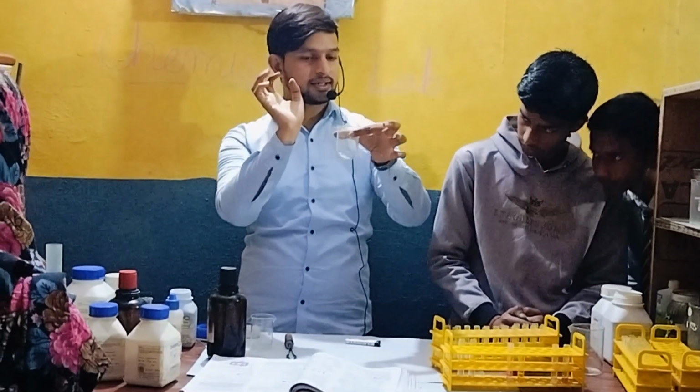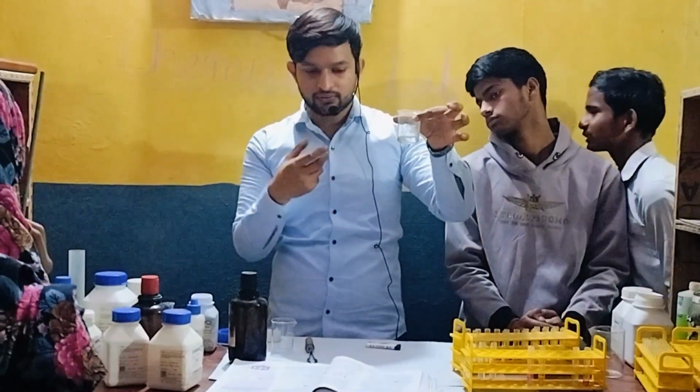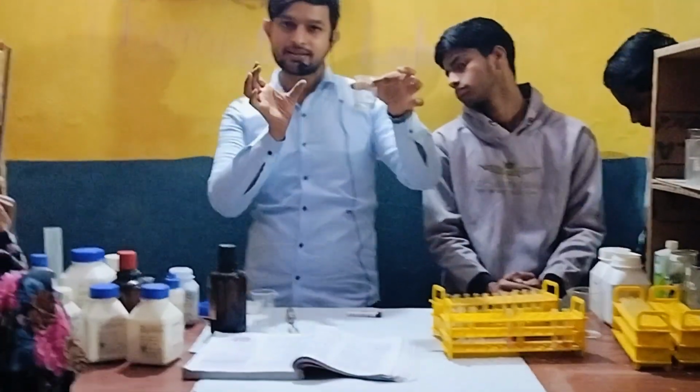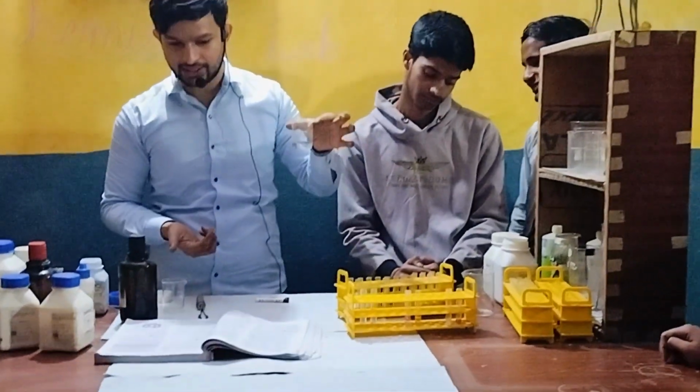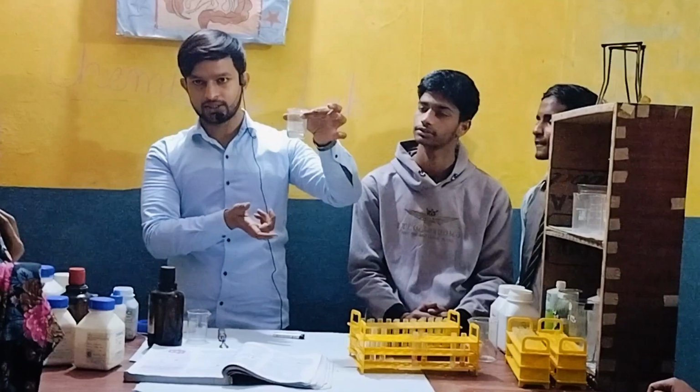What is this? Zinc. So I will place this zinc into water. Then what will happen? The zinc reacts with water and it will form Zn(OH)2, that is zinc hydroxide, and the hydrogen gas will come out from it.